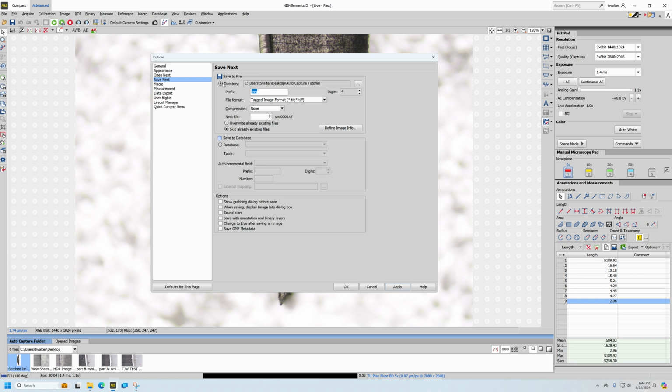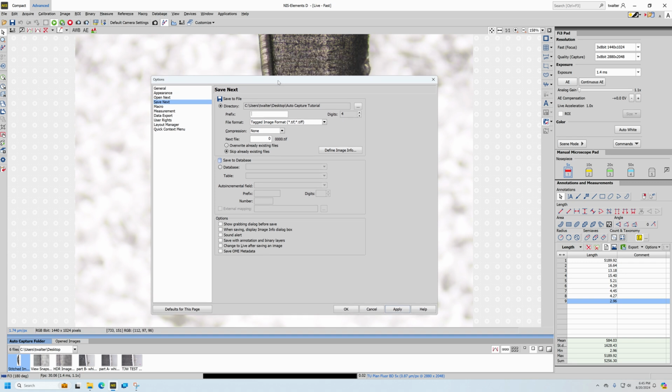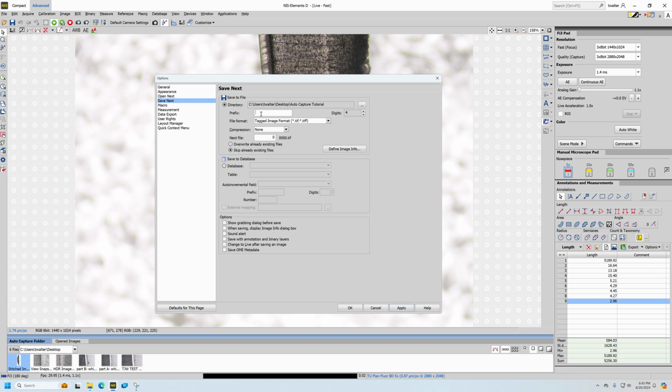The prefix can be whatever you want it to be. It can be really kind of any prefix. Ideally, all the samples are going to have the same prefix. Otherwise, it can be quite laborious to have to come in here and type in a new prefix for every single image that you're going to capture. Ideally, you have the prefix the same for any and all samples that you're going to be capturing an image of. So say that this was bumper.